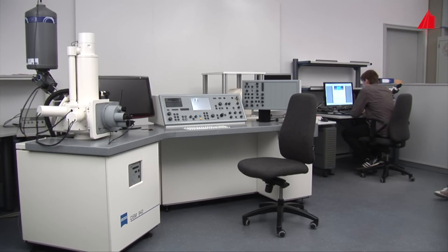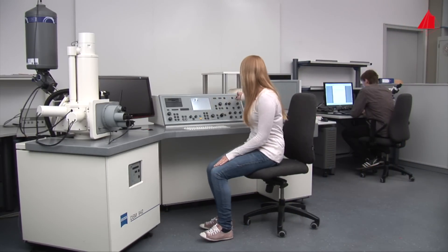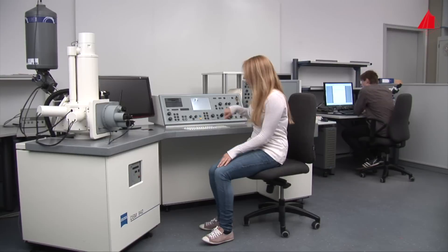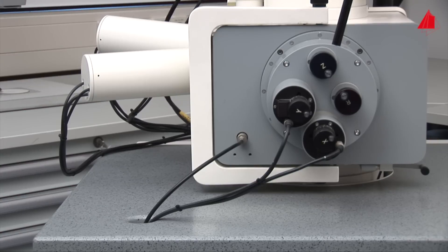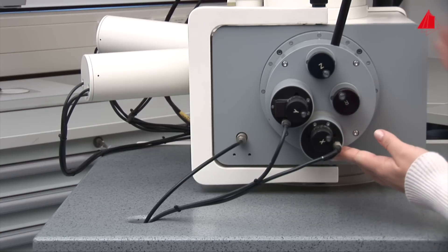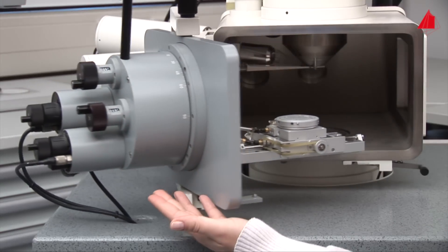The material tester turns on the vacuum pump control and vents the specimen chamber. After pressure equalization, she can open the cover plates of the specimen chamber. Together with the cover plate, the stage pans forward.